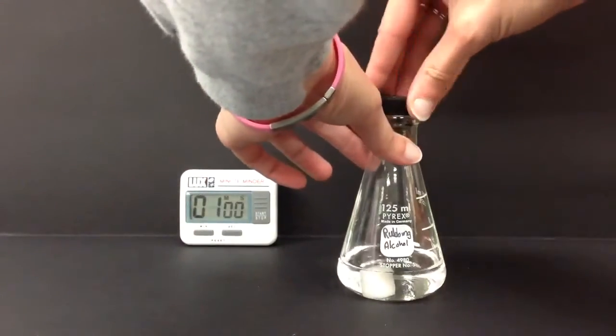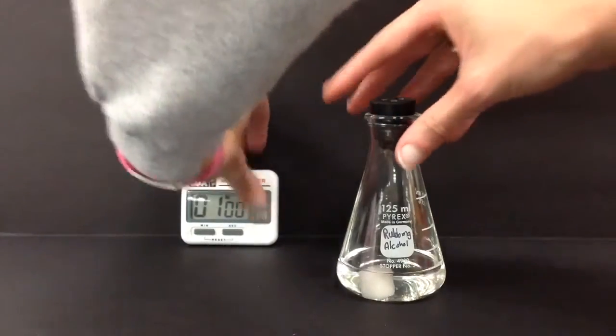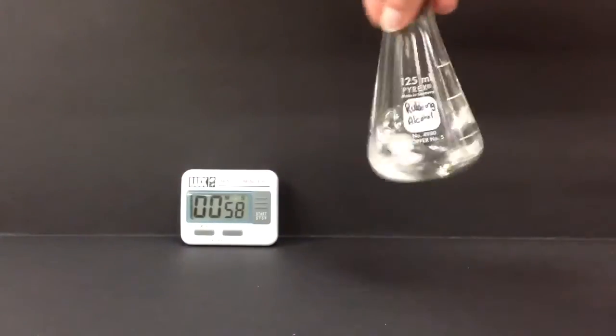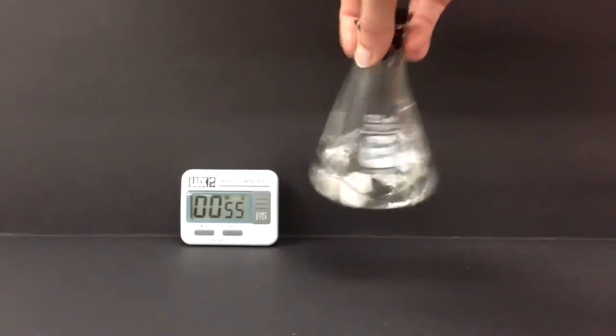The next solvent is isopropyl alcohol, otherwise known as rubbing alcohol. Again, we're using just one sugar cube and 50 milliliters of the liquid. Observe for miscibility and other changes.